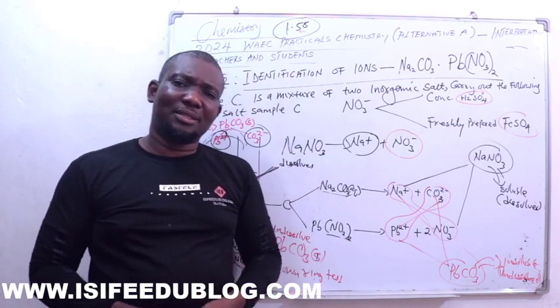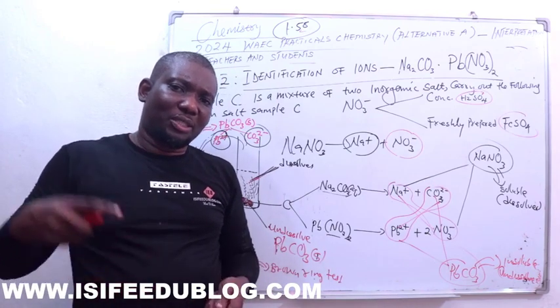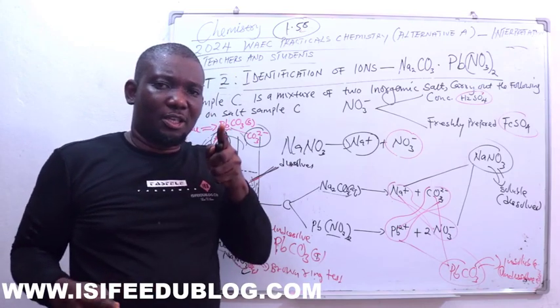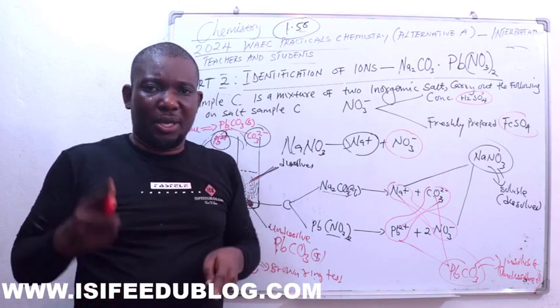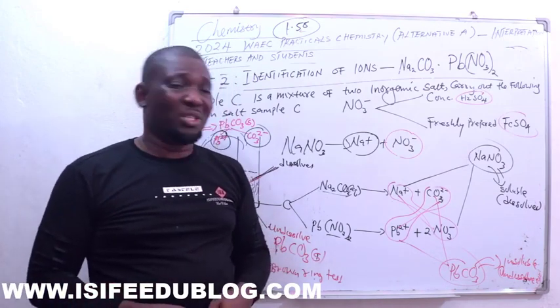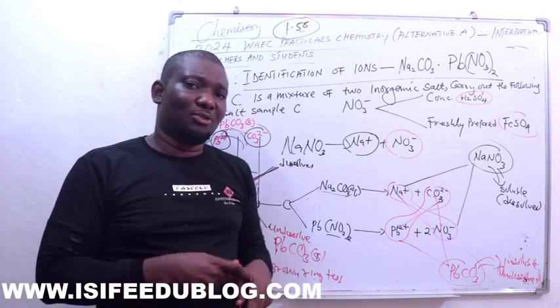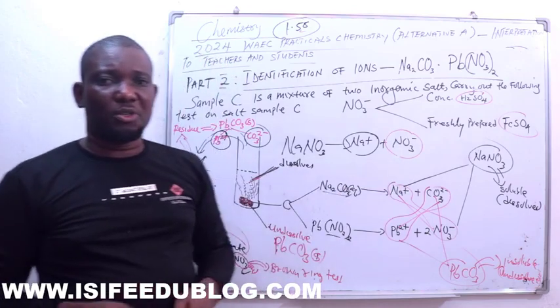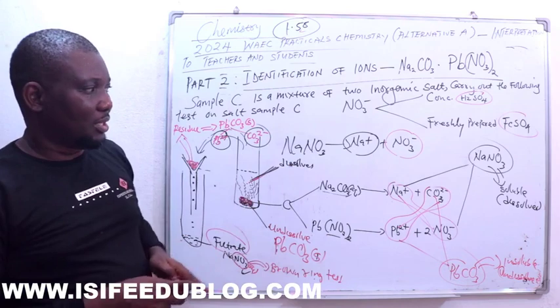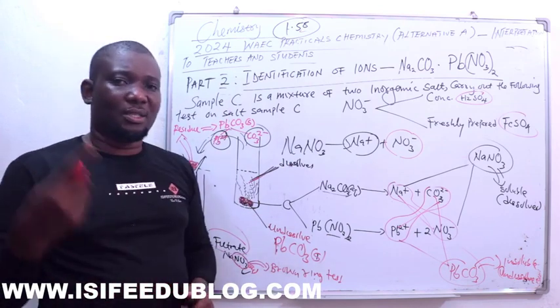The brown ring test is a test where extra care should be taken to ensure there is no form of interference, because the brown color can appear and still not be seen due to carelessness. So very, very extra care should be taken to ensure the brown ring is formed and read carefully. The teachers are very good at this, so they can carry out this test effectively.